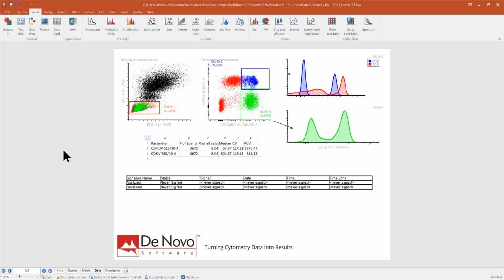So let me sign in as John, so that way John can do his job, complete the analysis, and then forward it to the administrator for review.